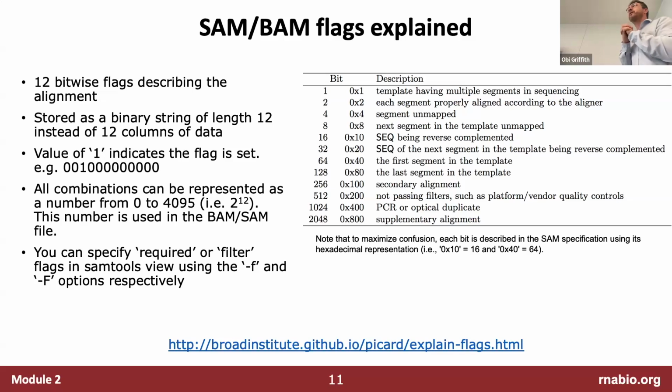Does anyone have questions about that idea? We're going to look at examples of it and pull out reads that correspond to different flags and use a tool online to convert between the flag number and the status of all these questions. I think by doing that, it becomes more clear. But are there questions right now about how flags work?